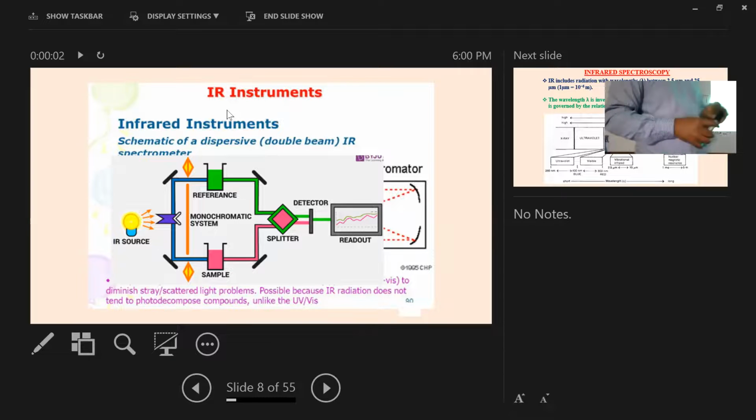But nowadays we can have very good quality infrared spectrometers, so that we can have a very flat line, and we can get the signal very clear, as much as the signal to noise ratio. Are you familiar with this word? Signal to noise ratio, or SN ratio. Okay, that is called like this, SN ratio. Okay, signal to noise ratio.